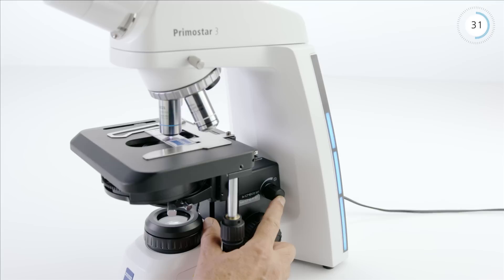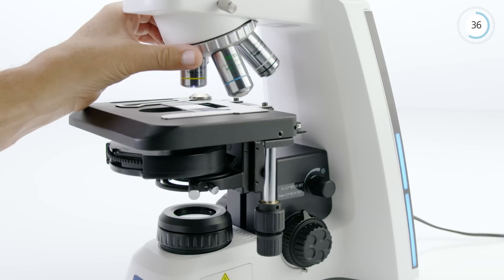Activate the Light Manager when changing lenses and the microscope will remember the precise amount of light you've set for each lens position.